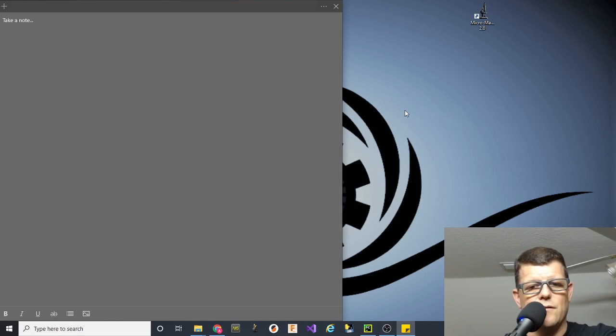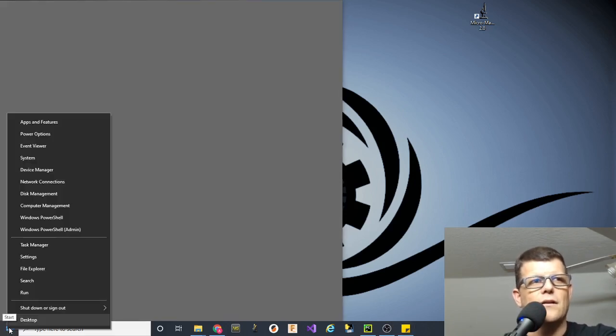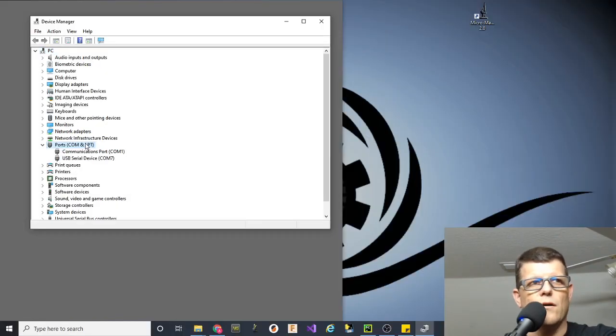The first thing I'm going to do is confirm the serial port that I'm using for my Triggerscope, and I'm going to do that by going to the Windows icon. I'll right click on that and I'll select the device manager. So what I'm going to look at here is the COM port where this is connected, and I only have one device. If you have multiple devices, the simple way to figure this out is to unplug your device and then the COM port will disappear.